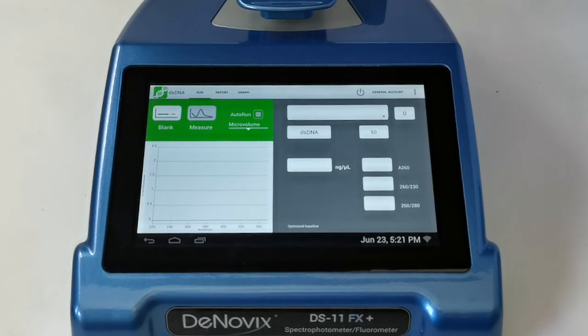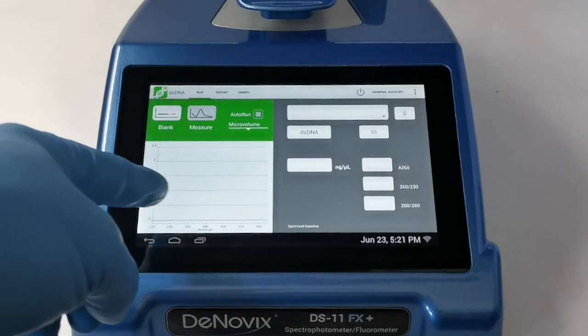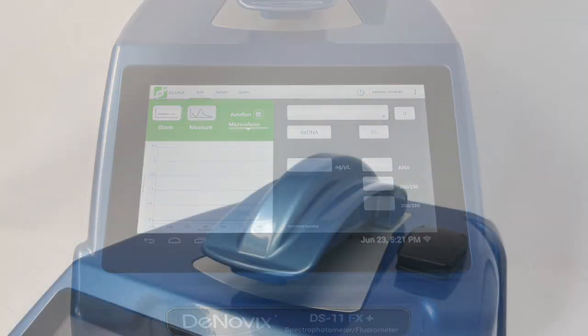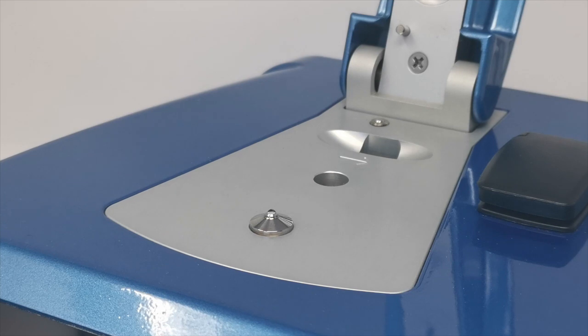When we come into the measurement app we see a simple layout giving quick access to the information you need. There's a blank and a measure button in the top left-hand corner — the measure button is grayed out until you provide a blank. We have an auto-run feature that automatically runs a sample without needing to touch the measure button as the arm closes. We can also choose between micro volume and cuvette mode using the drop-down menu.